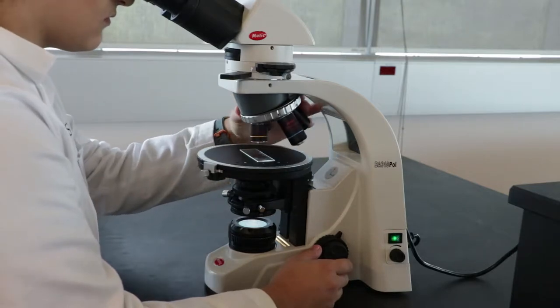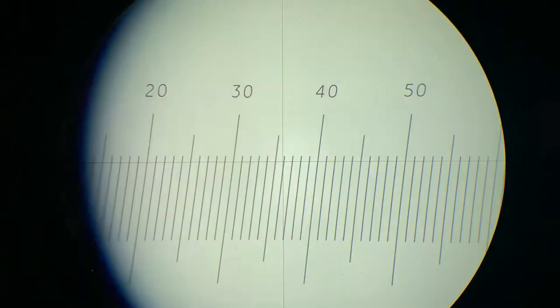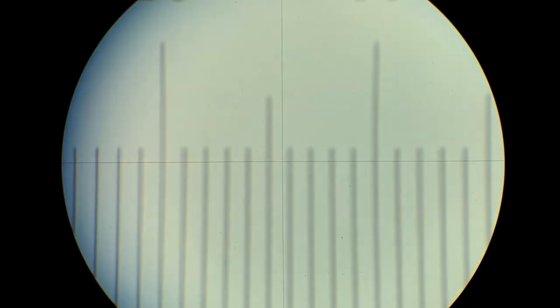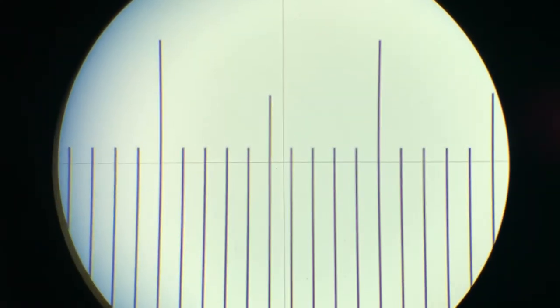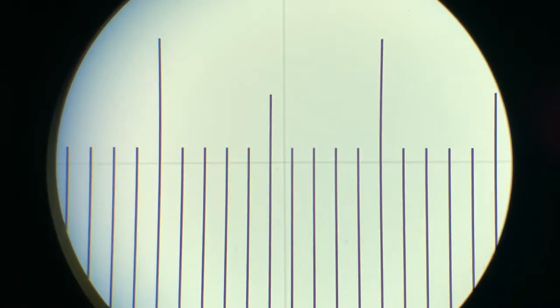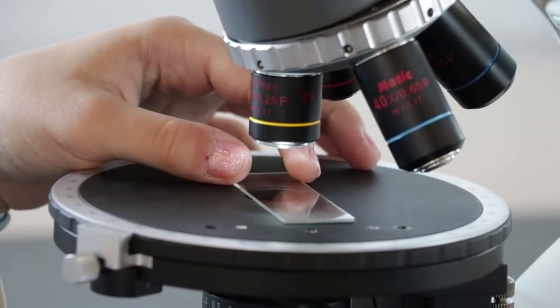Switch to your next objective, 10x magnification. Refocus using the fine focus knob only, and repeat the process. You'll be looking at a much smaller section of the slide, so aligning the bars may be difficult. Take your time.